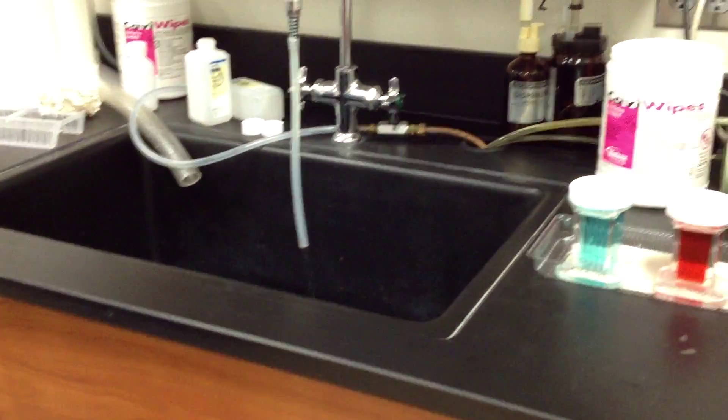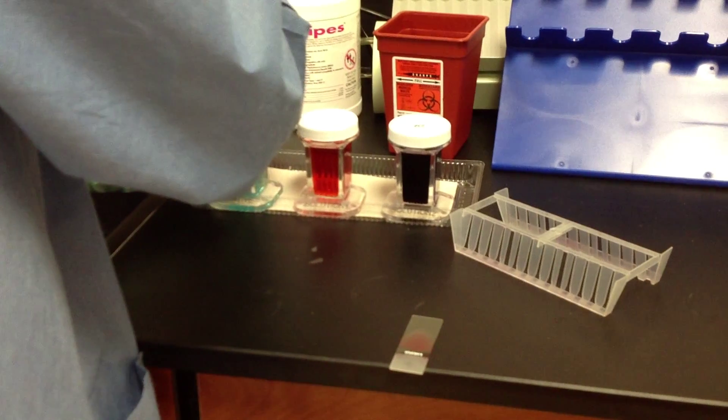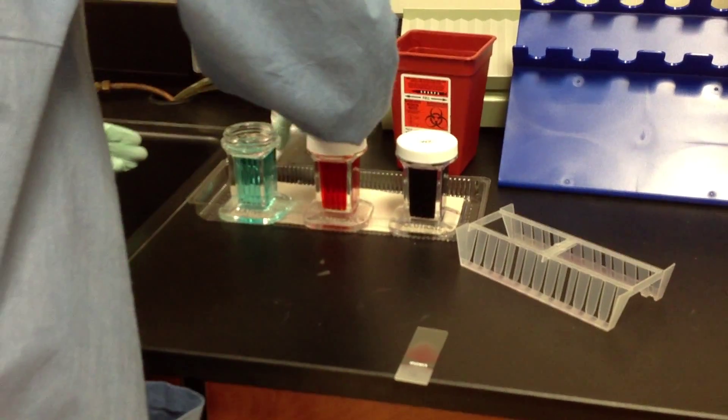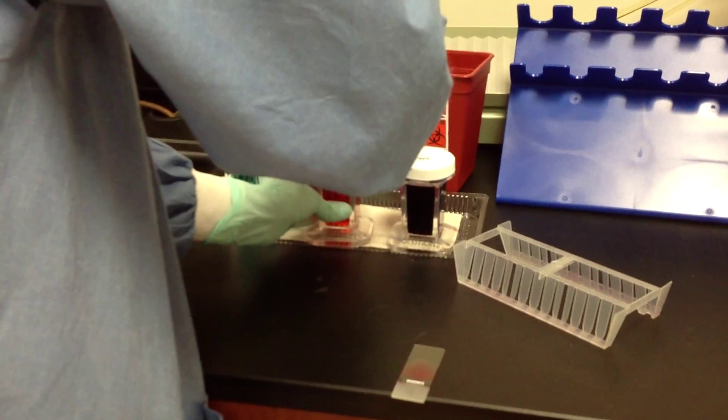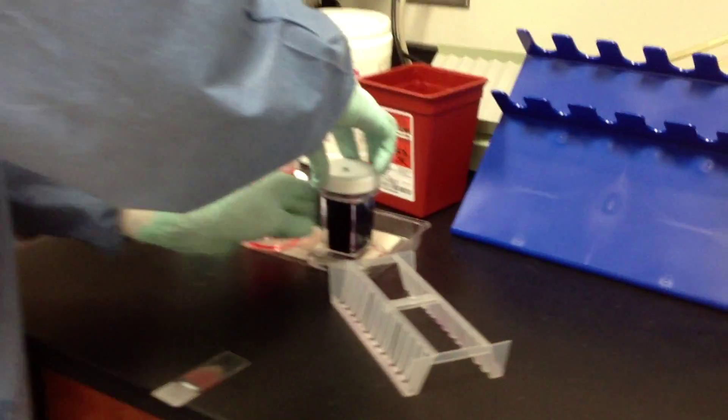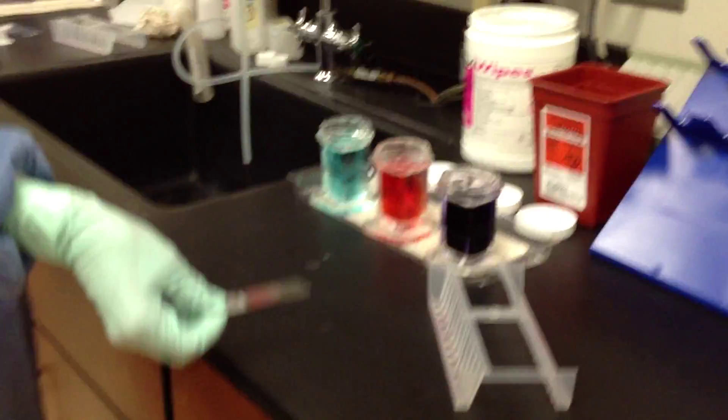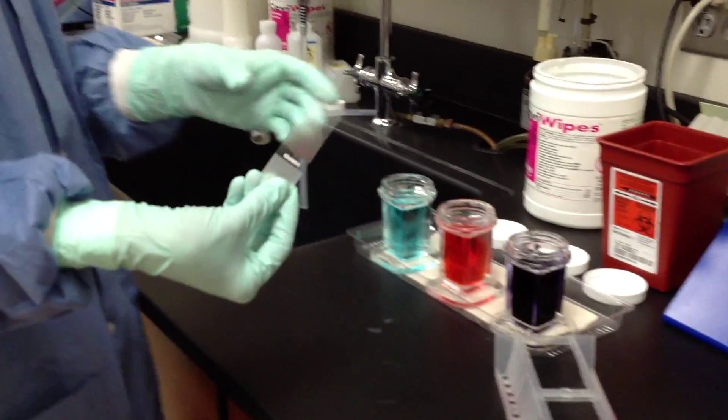Okay, so for our first specimen, we take the lids off of all the jars and turn them upside down behind them, so they're out of the work surface, and we have our dry smear.